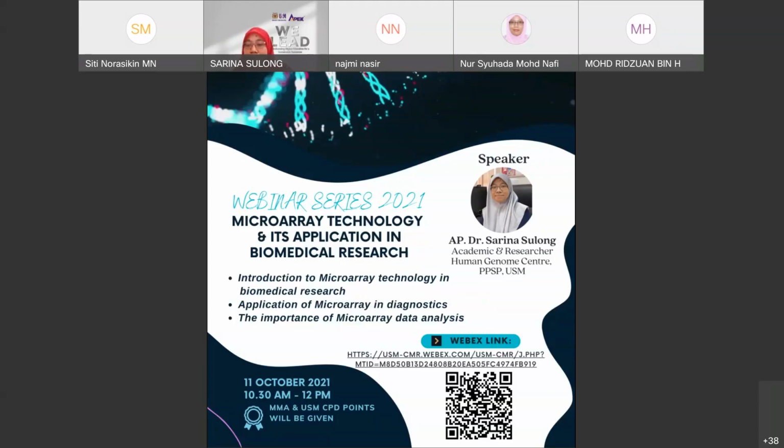Okay. Another question, Professor Rina. From Muhammad Rizwan: in diagnostic microarray, is it necessary or compulsory for us to validate the microarray result with FISH or conventional cytogenetics or other modalities?